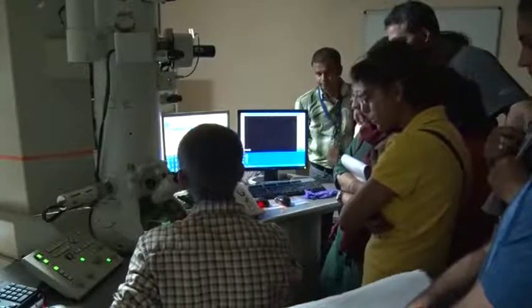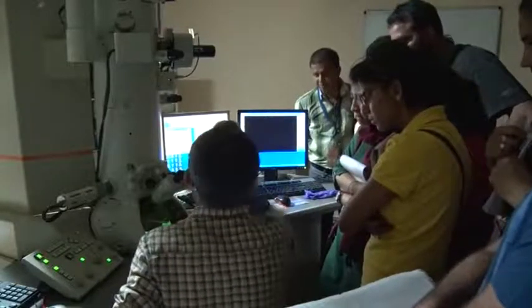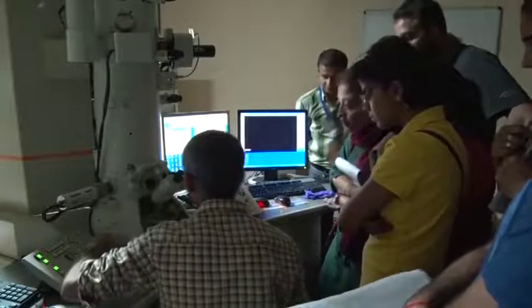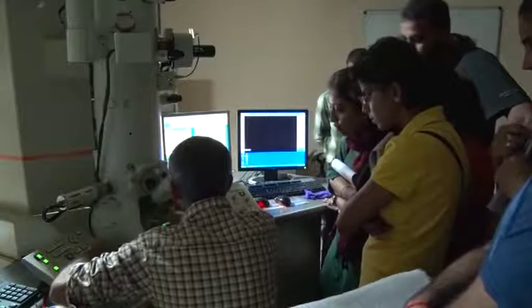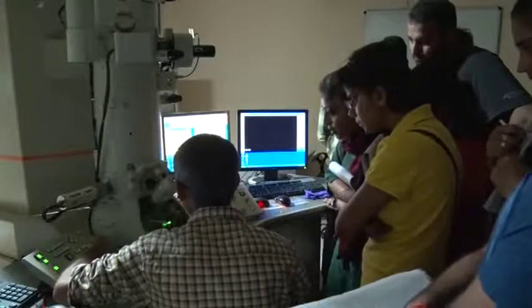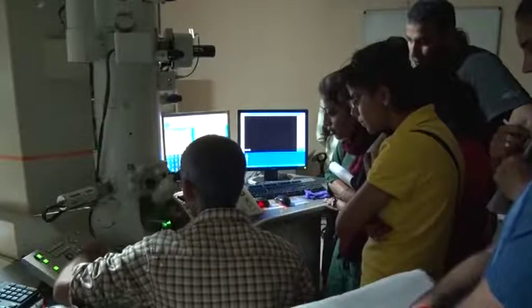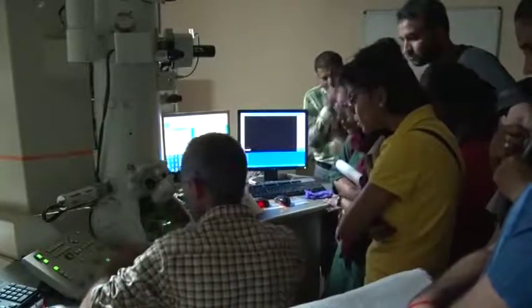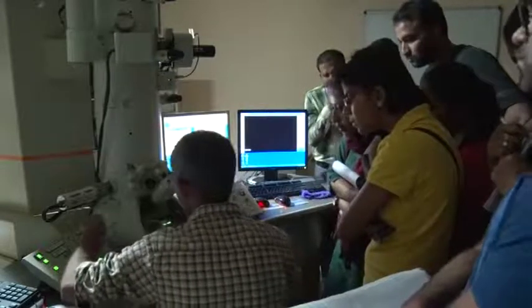The second step was that we wanted to align the condenser aperture. If I now focus it, then it is coming to the center of the screen. If at the center of the screen you see some black spot, it's actually a hole. That is where it is converging. See, it has come to that. There is a slight shift, but that shift is more or less minimal. How to bring it to the center is with this shift.